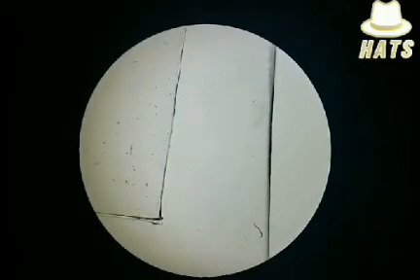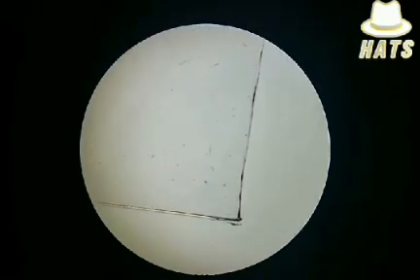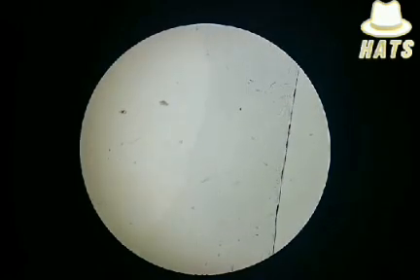I'll put the camera on the microscope objective here. This is at 40x magnification, and we will make a very quick cover. This is the cover, a little cover glass.